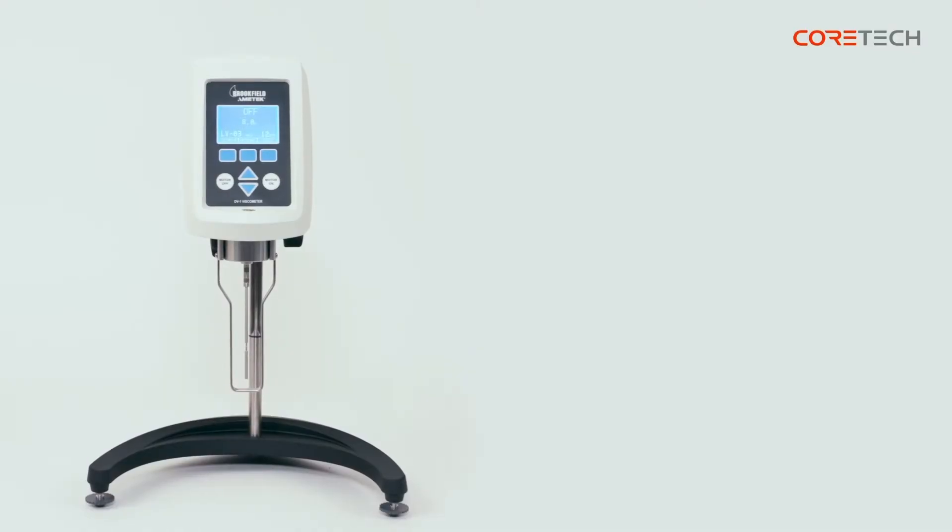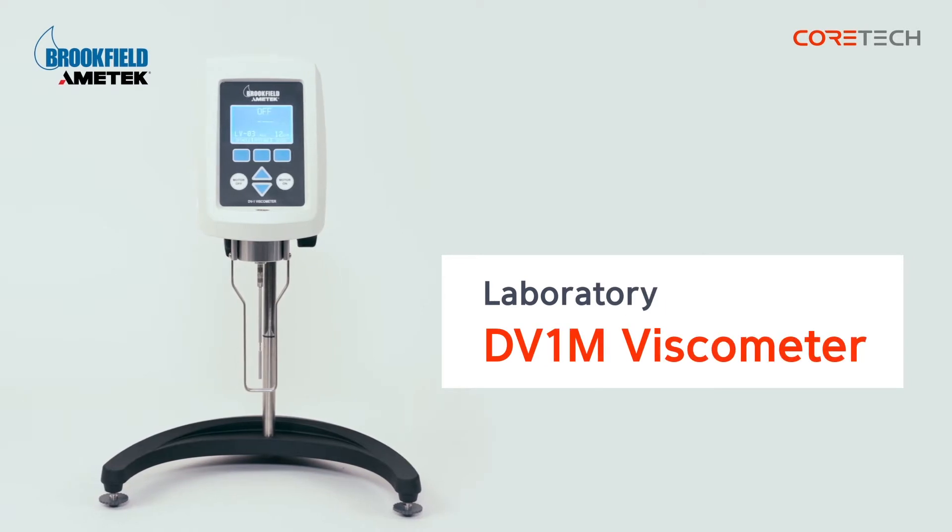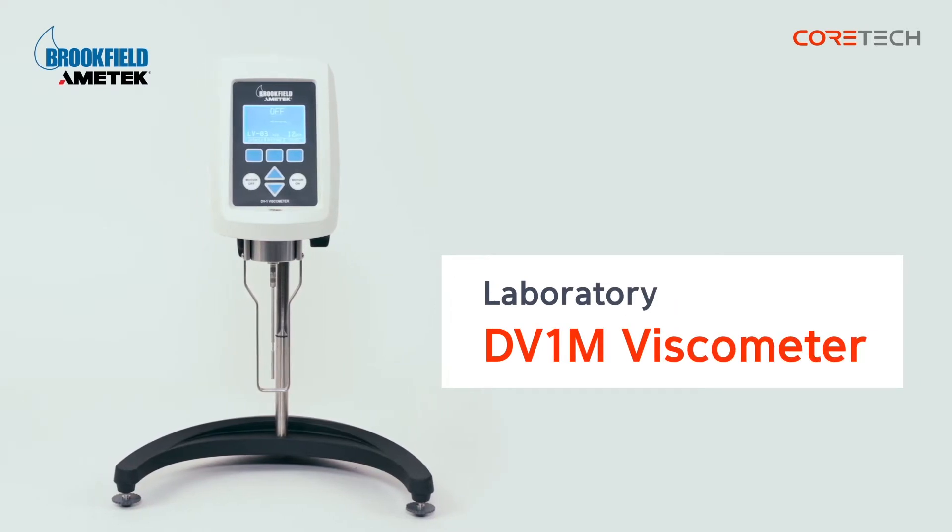Hello, this is Core Tech Korea. The product we're going to talk about today is Brookfield's Rotary Viscometer, DV1M model.